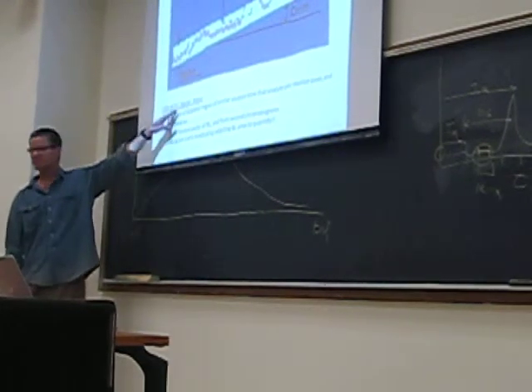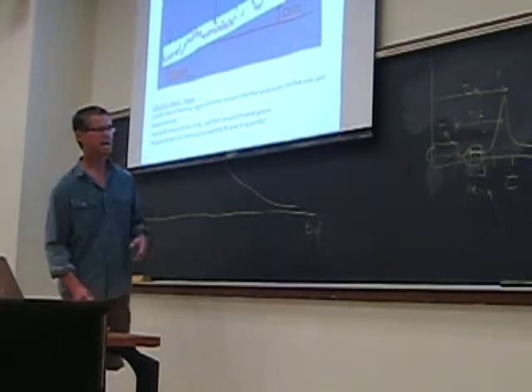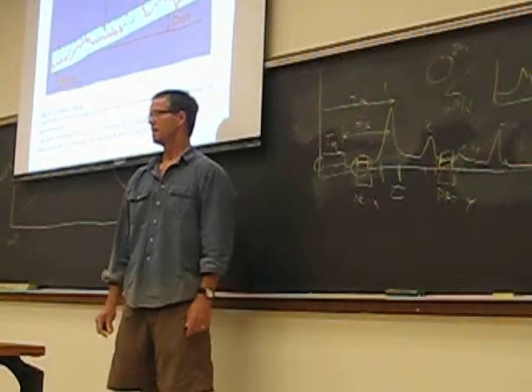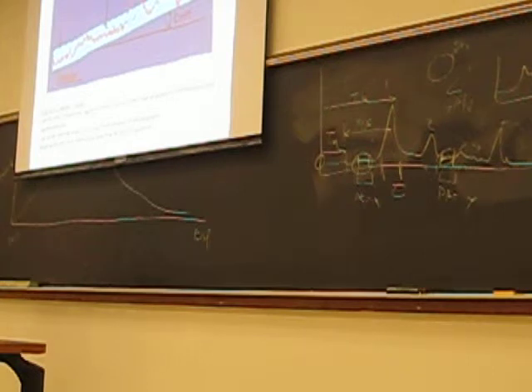Or you can inject a blank 3 times. If you inject it 3 times, look over that same area where your peak would normally be eluting, and see what that peak area is, right? That's the alternative approach.